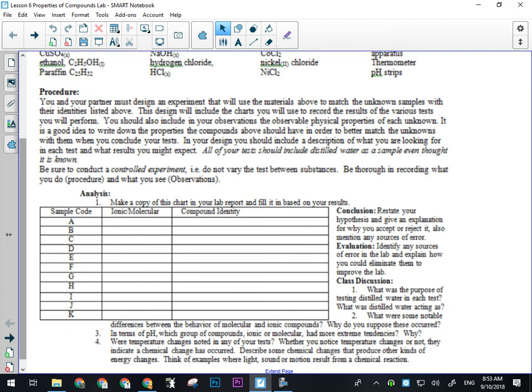So each time I run this experiment, what am I doing different? Yeah, we're going to talk about it. We're not even there yet. As the experimenter, each time I go into this experiment, what am I changing? Right. Each time I do this experiment, I'm doing it on a new material. I mean, this is all kind of one experiment, but I'm testing each material in exactly the same way. So does that mean that could be our manipulated variable?